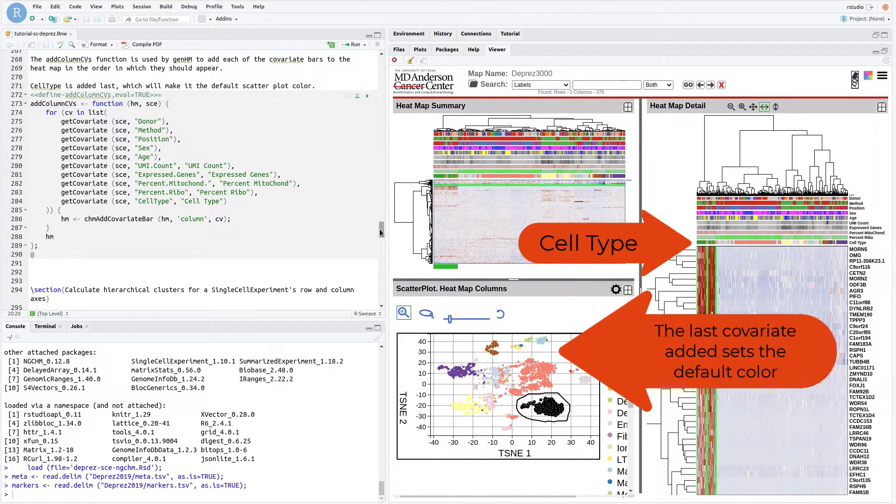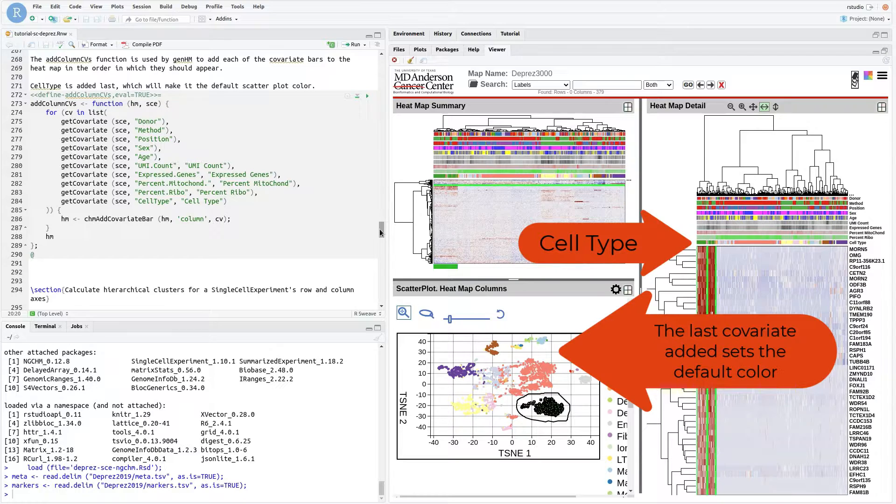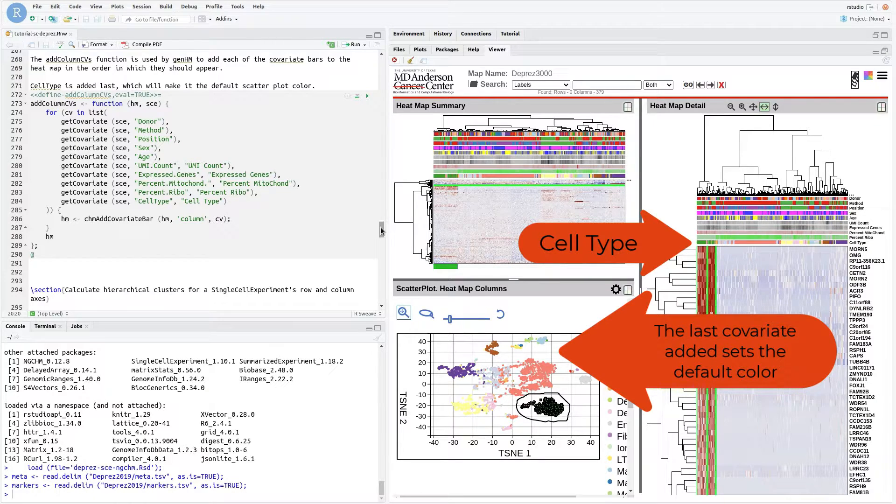Since cell type is last, it is the default covariate for coloring the reduced dimensionality plots.